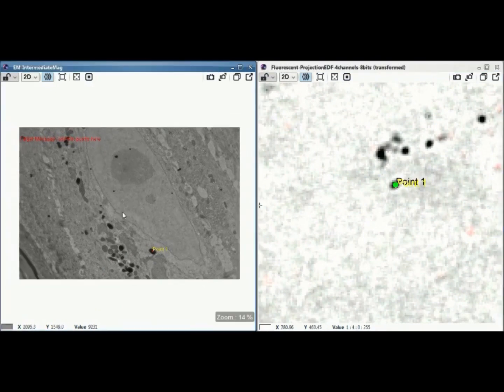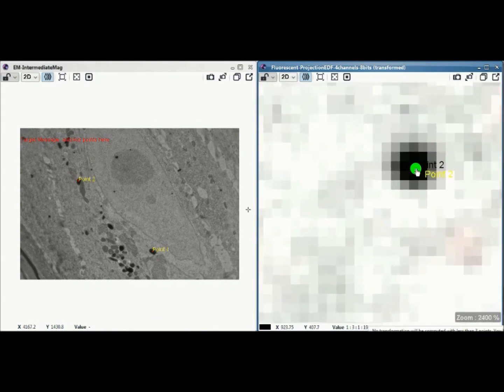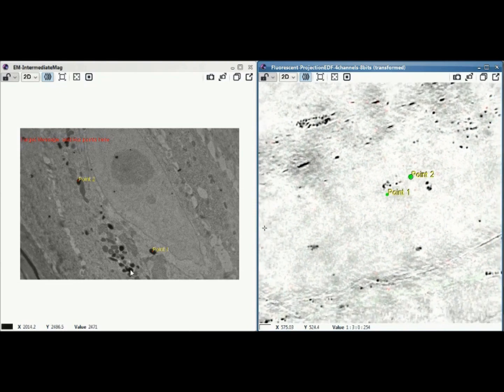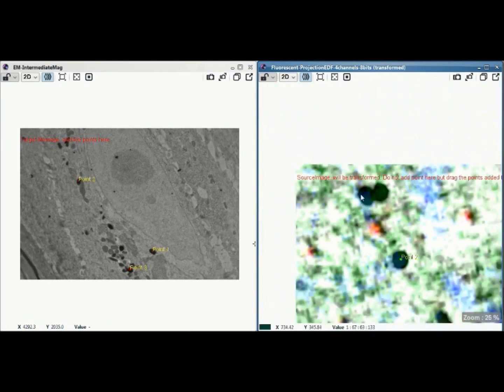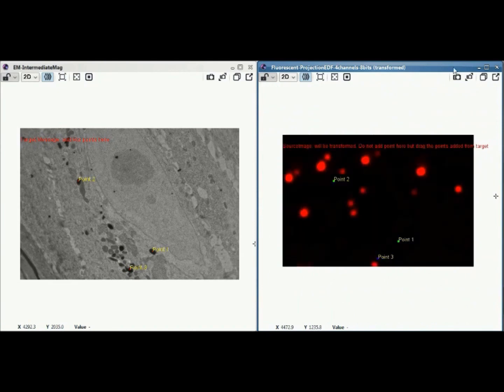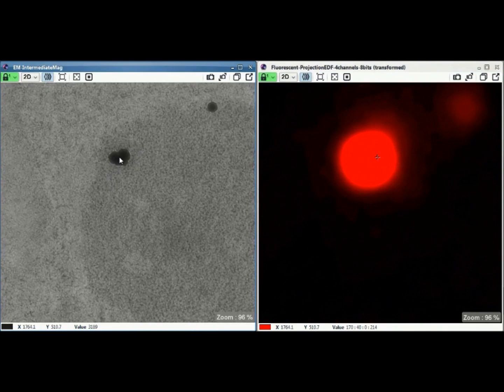We place a point in the target image and then we locate it in the source image. Then you place a second point in the target image, and when it appears in the center of the image, you locate it precisely in the source image. And you do that for 3 points in 2D, up until it's able to identify both the translation and the rotation of the image. And then it will automatically calculate the first transformation and make it similar to what you have in electron microscopy.